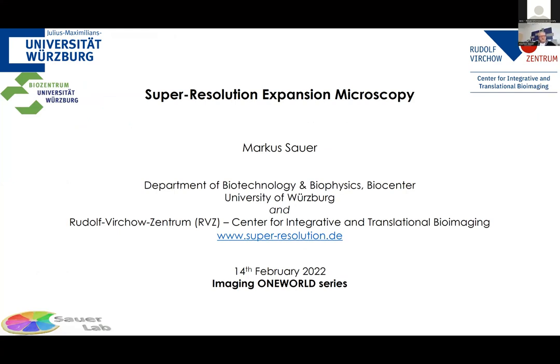Well, the title has already been announced, super resolution expansion microscopy. So I will take the chance and just very briefly talk a little bit about localization microscopy with a particular focus on dSTORM, of course, a few slides, and then I will come to discuss technological advancements to further push the resolution of optical light microscopy. And one of these examples, at least for me, is expansion microscopy in combination with super resolution microscopy techniques.